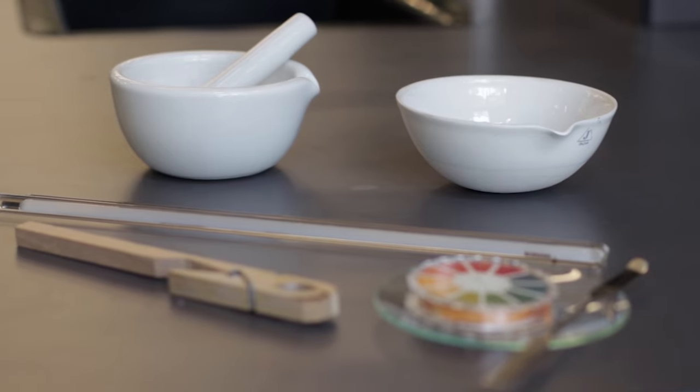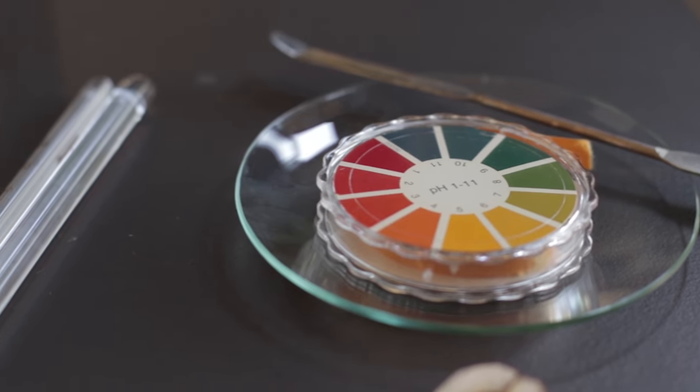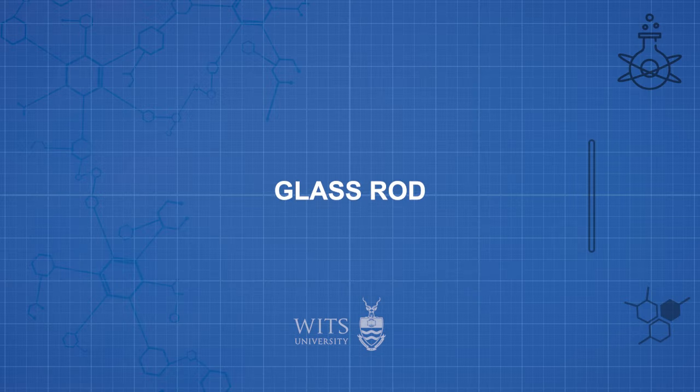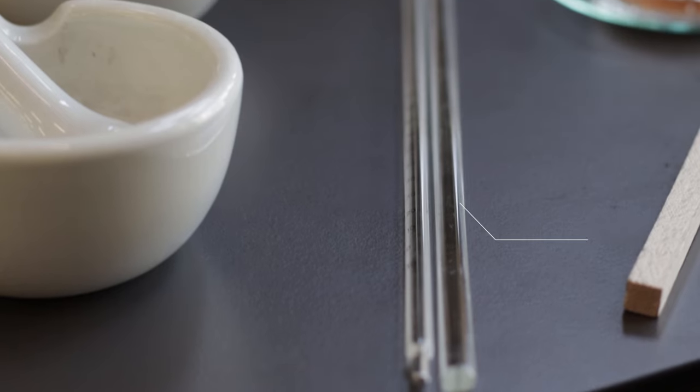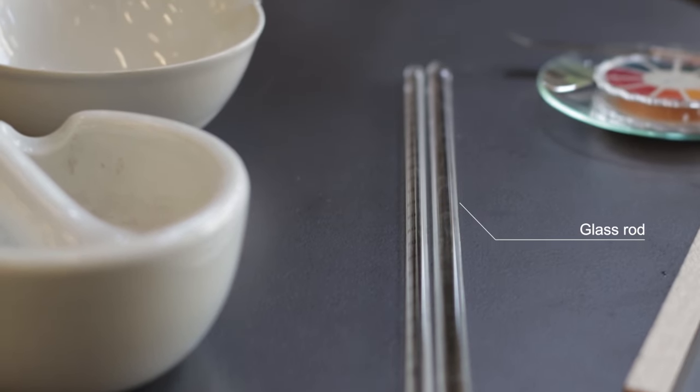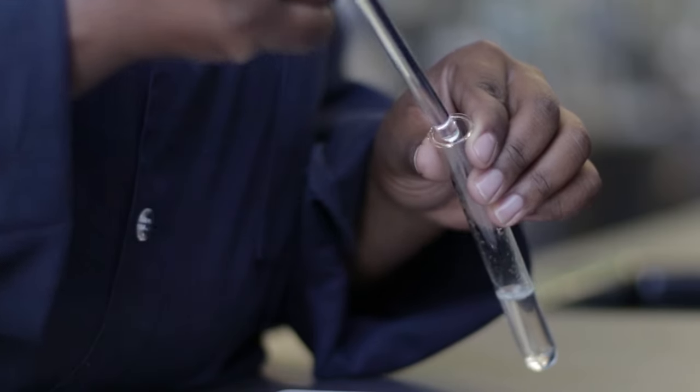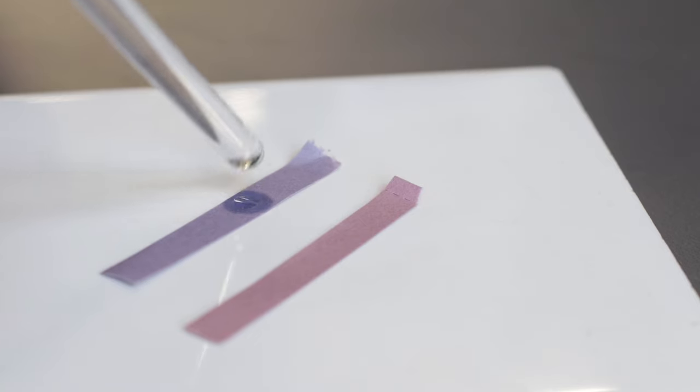These are other pieces of apparatus which you will use in your experimental practicals. A glass rod is used to mix chemicals and liquids and to dab litmus paper with solution to determine pH.